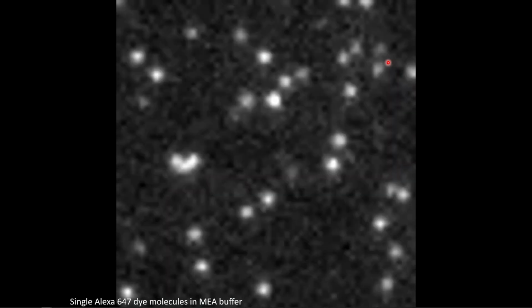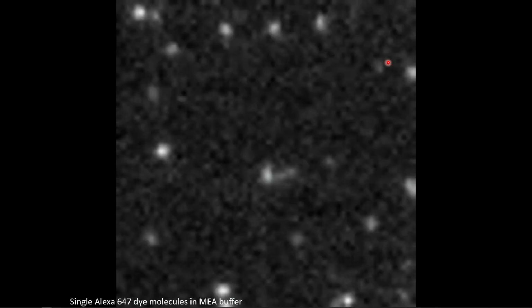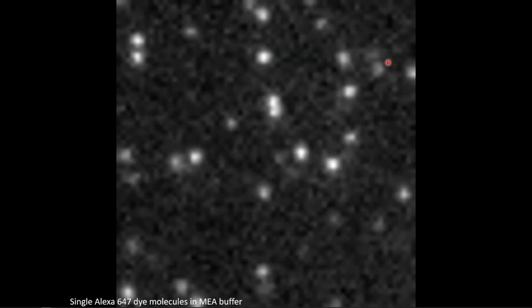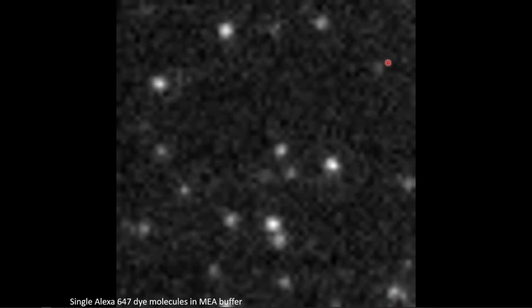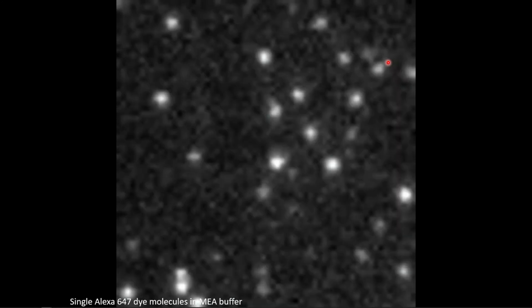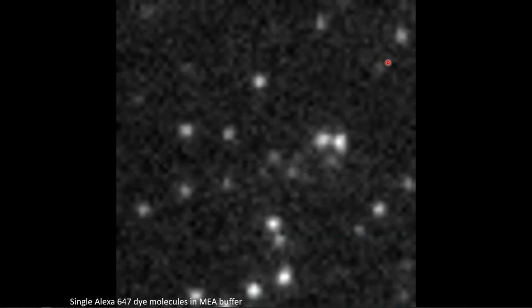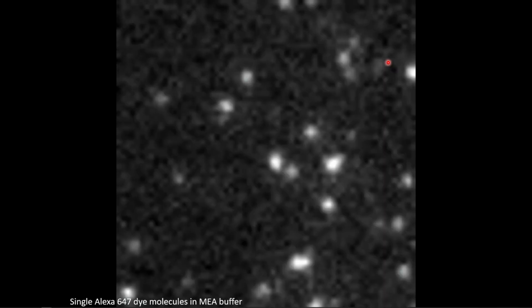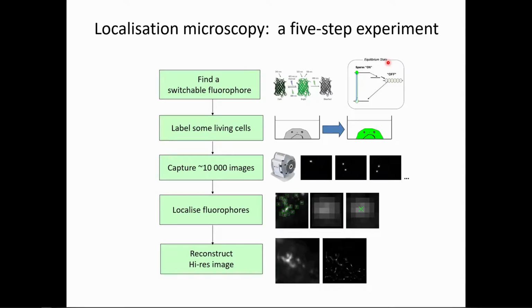They are in a buffer solution on a cover slip, and these flashes of light are these individual molecules. You can see that only in fluorescence can you do that. You see the bright signal on the dark background. This wouldn't be possible with any other method, right? So we can routinely detect these individual molecules. They blink on and off, and this information alone does nothing. But actually, when you then assemble the localization positions, you get the images back. You get information about the sample back.